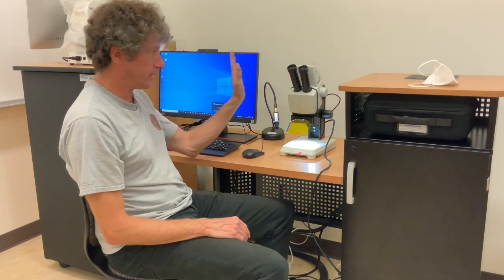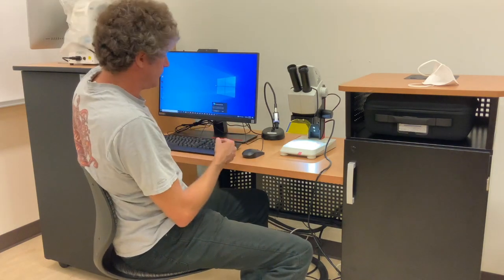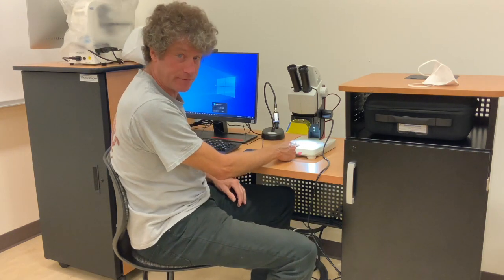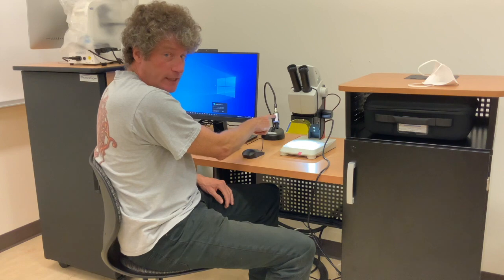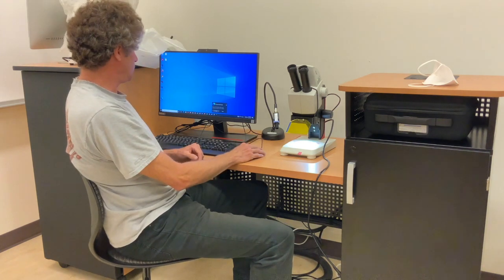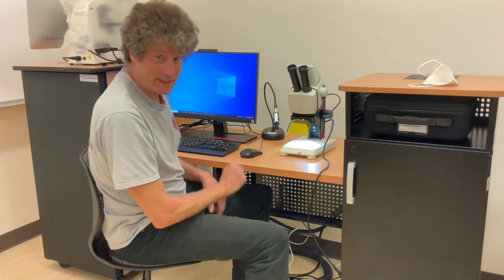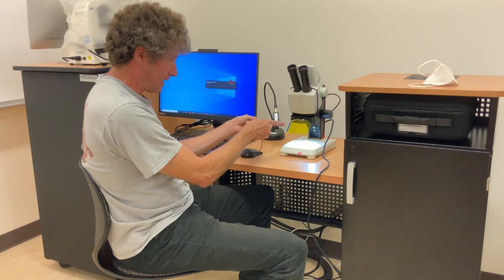Here's your dissection scope started up and running. What you're going to do is take the cover off here and put it away. The power button is in the back right here for the regular bright field light. We also have a blue light for fluorescence, and then we have the computer. You'll log into student and then start the LASX software and grab a sample and put it down there.